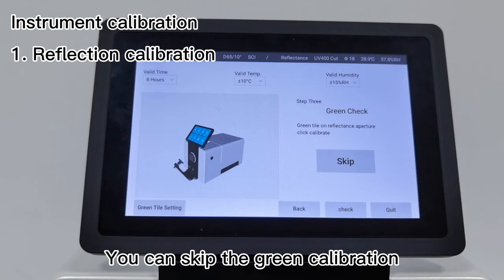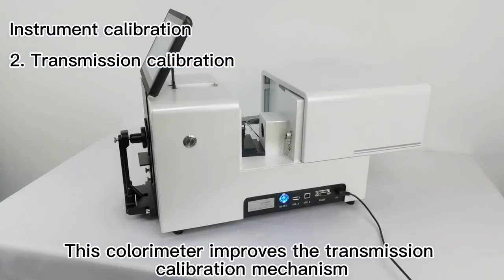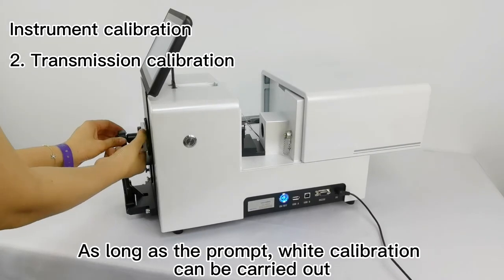This colorimeter improves the transmission calibration mechanism. As long as the prompt, white calibration can be carried out.